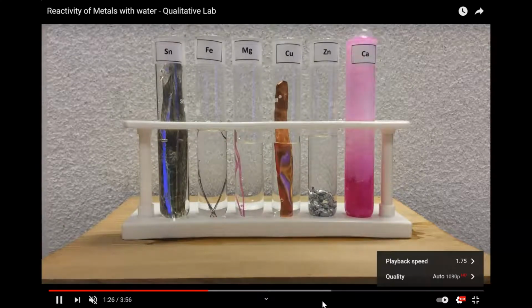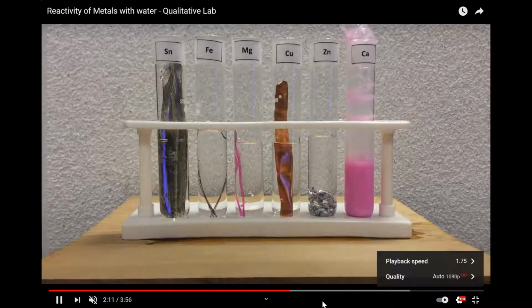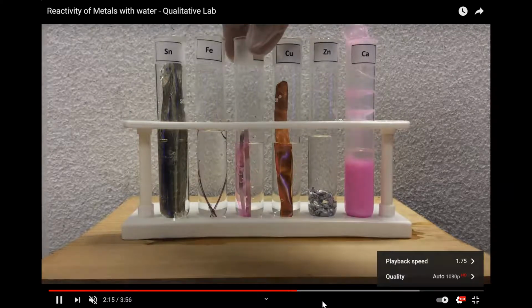Calcium is by far the most reactive. And then magnesium is reacting slower. And hopefully we've got another couple of minutes to go, and we'll get to have a good look at the others up close. But clearly calcium is the most reactive, and magnesium is still just slowly turning that phenolphthalein pink.